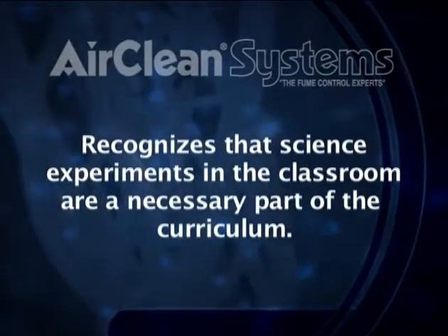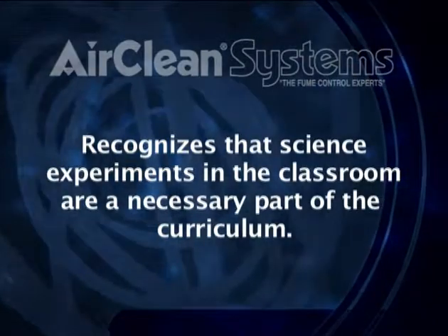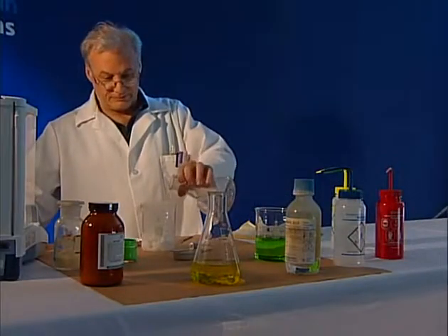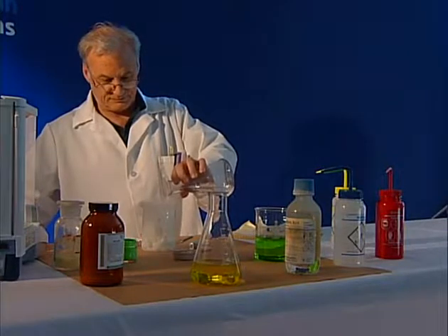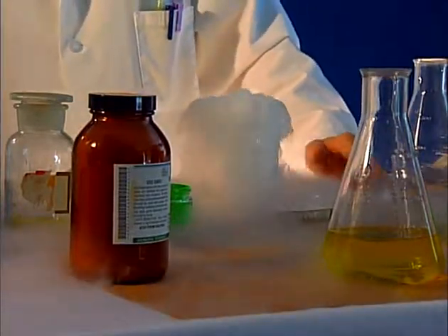AirClean Systems recognizes that science experiments in the classroom are a necessary part of the curriculum. Hands-on demonstrations enhance the learning experience for students. These demonstrations may produce smoke, heat, or release toxic vapors.